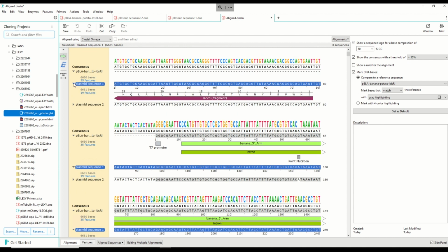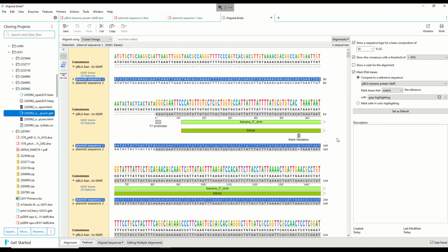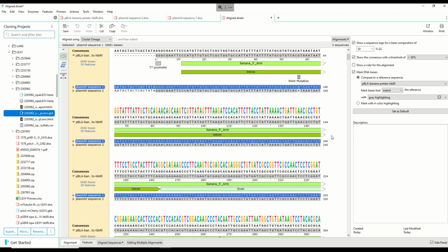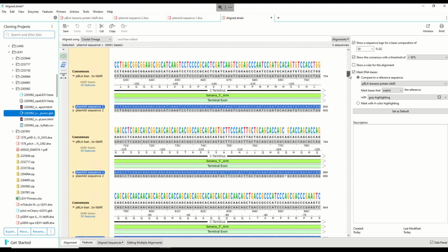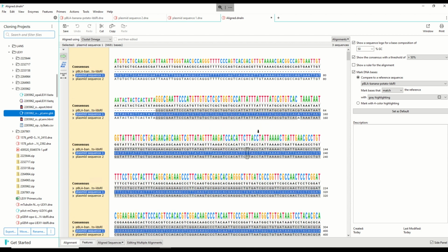So what I like to do is actually drop down the template sequence, my expected result, and then I can compare where any mutations are, right? And yeah, so then you can compare the sequence. Another thing to note is that in SnapGene, it's going to align the sequences exactly as you give them, right? So you see how, if I do that, it's a lot easier to see.